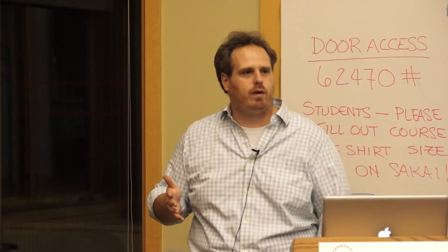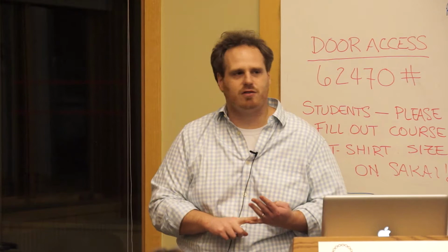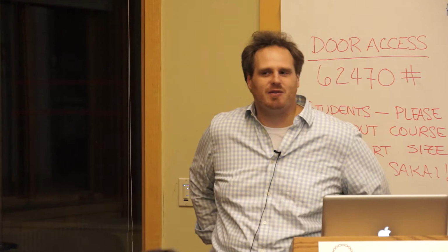I'm really a concepts guy. So in a month, we'll remember Dickens, remember the three secret ingredients to a good assembler. You'll remember, oh, if we use short reads, we should use ALLPATHS. If we're using long reads, we should be using Celera assembler. In reality, what you remember is, oh, I think I have a PDF someplace. It has a bunch of notes on this. So knowing where the right answer is really the most important thing to remember.